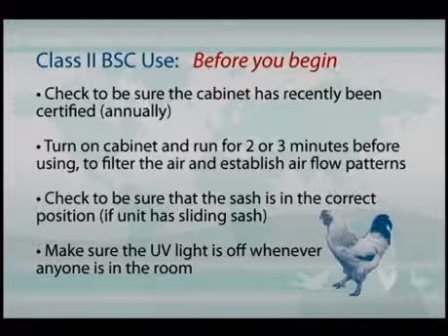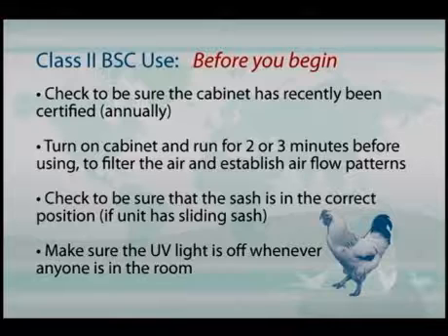And of course, if the cabinet is supplied with a UV light for disinfection or decontamination of the cabinet, these lights must be turned off whenever anyone is working in the room or certainly within the cabinet.